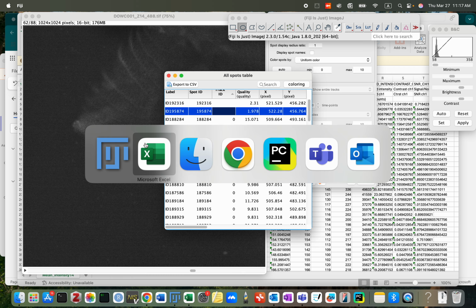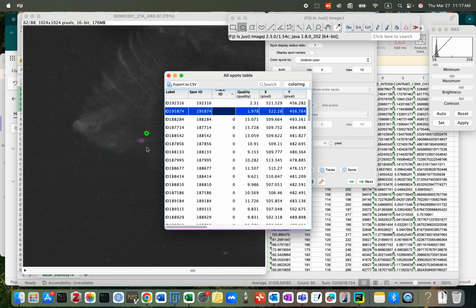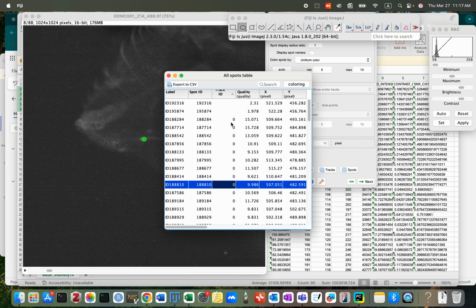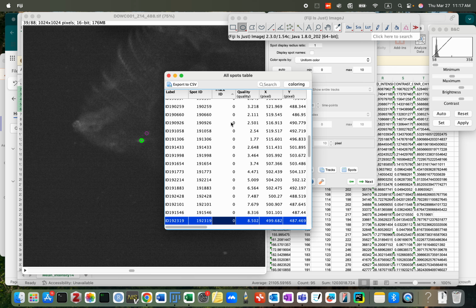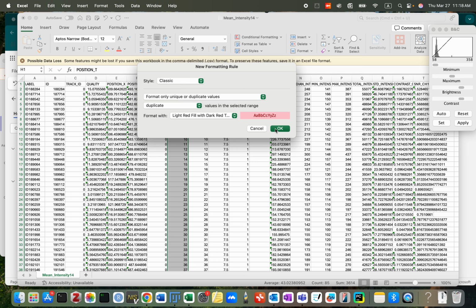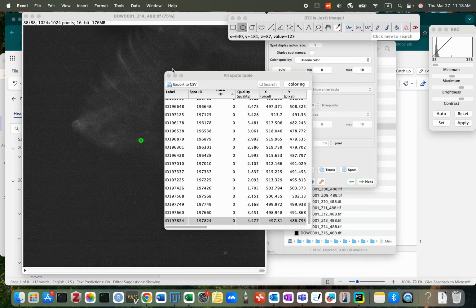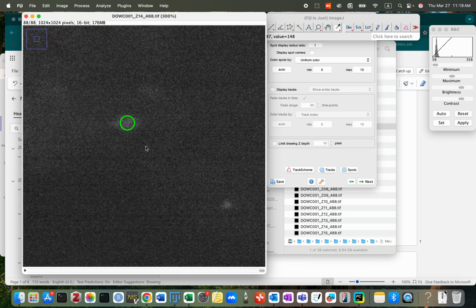Okay, first two are wrong. Let's delete together with the header. Now we see track ID 0, these are correct. All zeros are correct. Okay. Duplicates. Background. I use 16. So I use 15 for this channel.